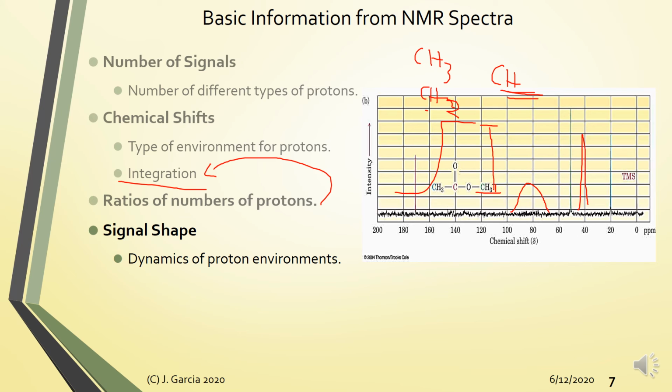Okay, so normally this broad peak in proton NMR, sorry, this is carbon-13 NMR. So the broad peak in proton NMR is usually associated with what you call your D2O exchange. Okay, the D2O exchange, so this usually happens if you have hydroxyl functionalities. Okay, signal splitting, so this is in proton NMRs.